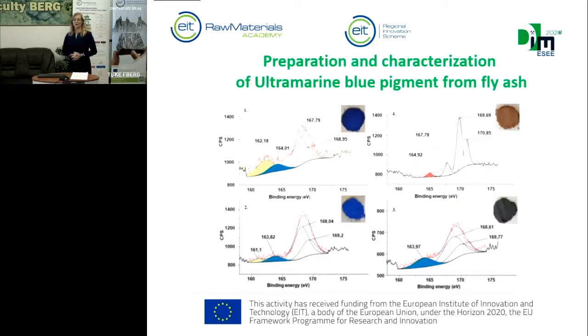We prepared four samples, and two of them had a very nice blue color, and by the XPS method we confirmed in these samples yellow and blue chromophores. These chromophores are very important for the creation of this color.